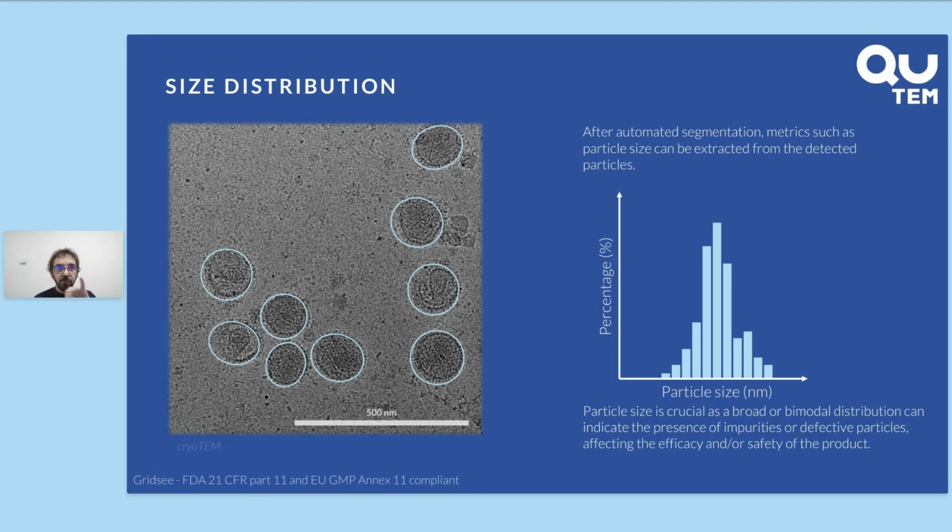So if you see two peaks, you can see, oh, this is my individual particle, and this peak, which is a bit broader, maybe it's two particles which are next to each other, or maybe it's something completely different. Maybe it's an exosome, or if it's smaller, maybe it's some subunits which are not properly assembled. So in this case, TEM is a very strong tool in that it helps you to characterize the particles and the peaks.